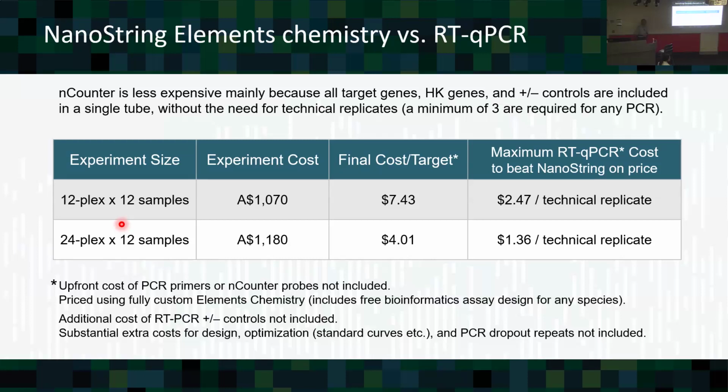There's still reverse transcription bias and there's still all kinds of biases in there, but the assays have come a long way over time and they're probably the best. RNA-seq's better than PCR, right? But there's still compromises in there. If you know your targets, I would do this.